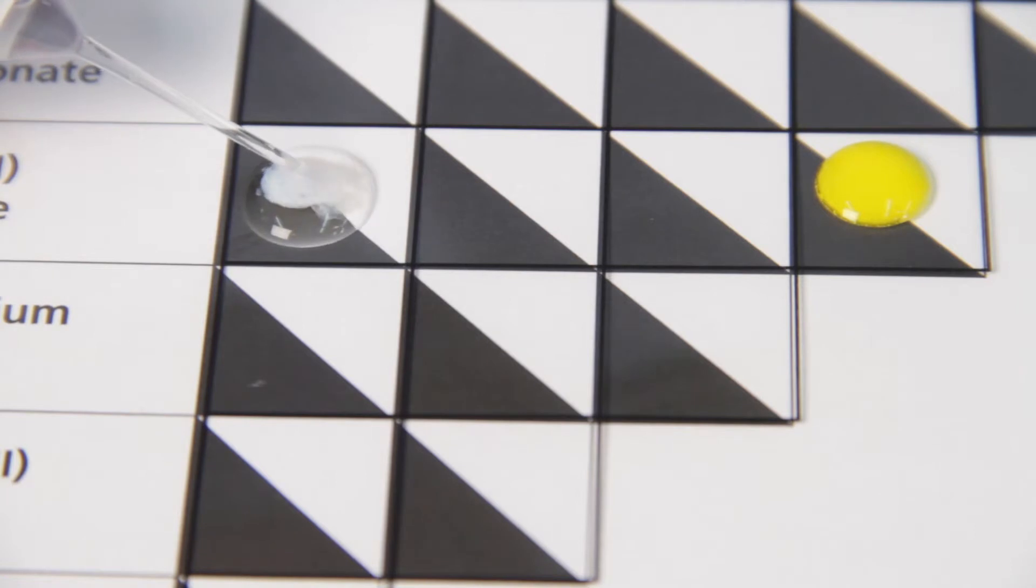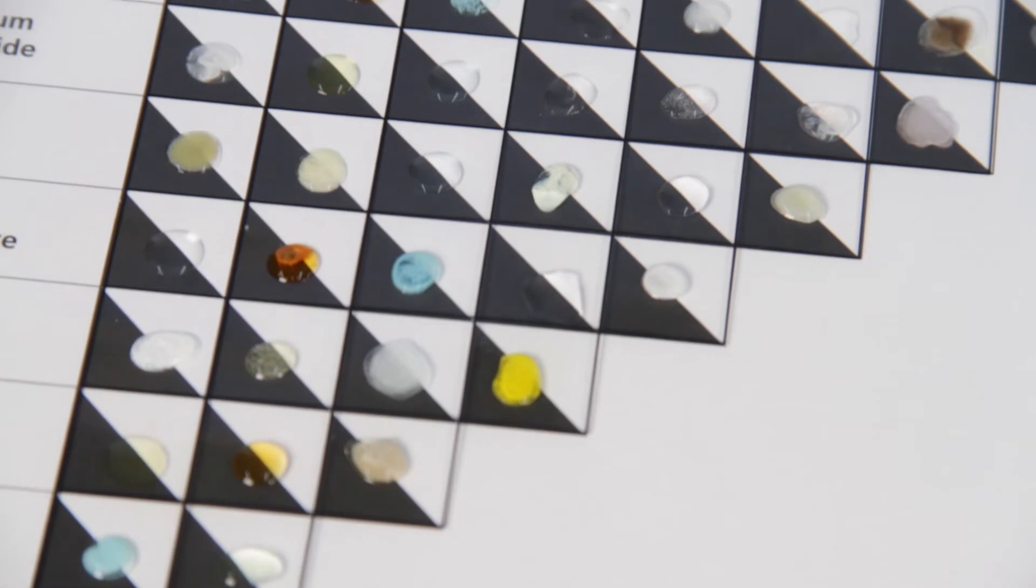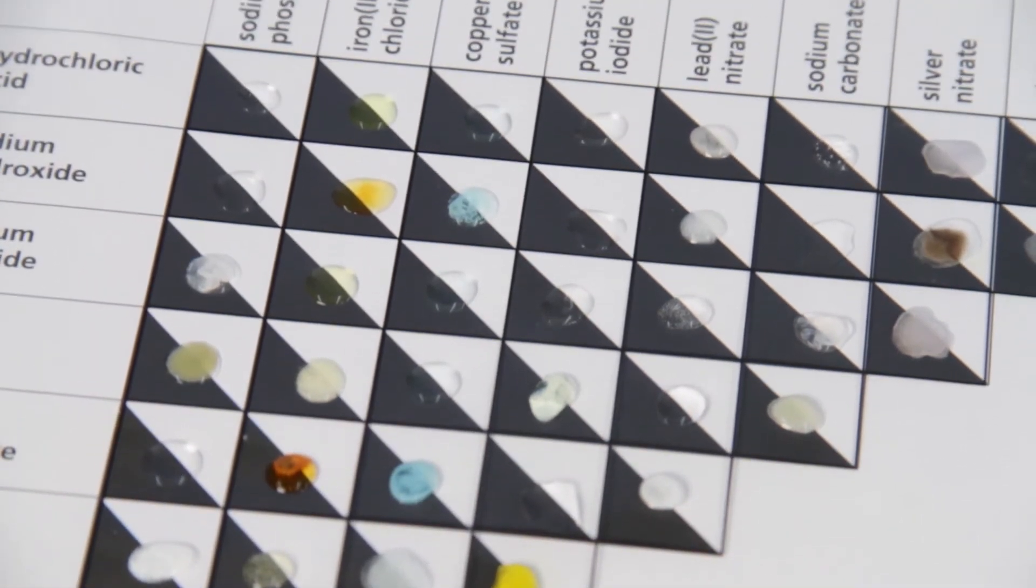Students work their way through the 45 individual reactions and record their observations, including formation of a precipitate, formation of a gas, and changes in color.